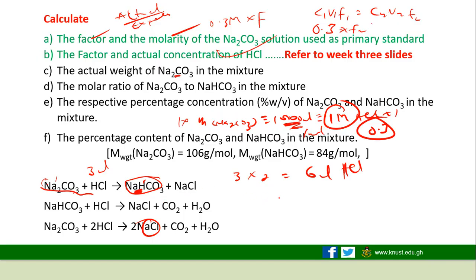Good. Now, at the methyl orange endpoint, everything has been reacted with, right? Assuming the total volume was 7. For us to know the amount of HCl that reacted with just the bicarbonate present, it will be 7 minus the phenolphthalein endpoint. So the 7 minus the 3, that will be 4. It means 4 mL of the HCl reacted with just the bicarbonate in the medium. And then we can also extrapolate by doing milliequivalent calculations, correcting the mass using the assay values if given, right? And then doing other extrapolations. Very simple.